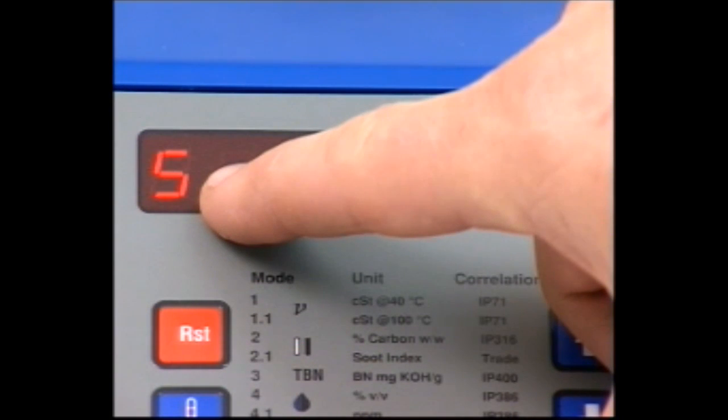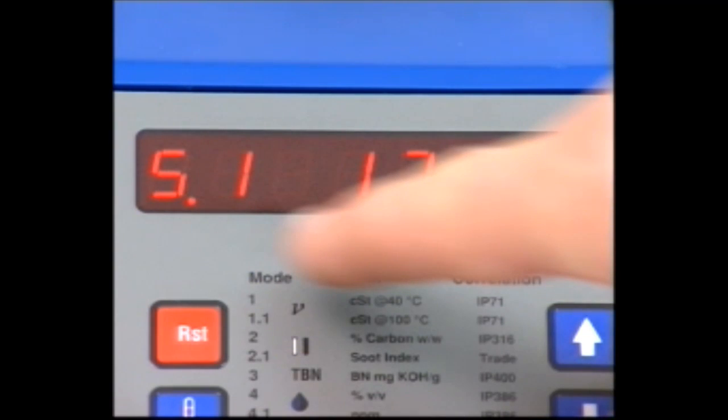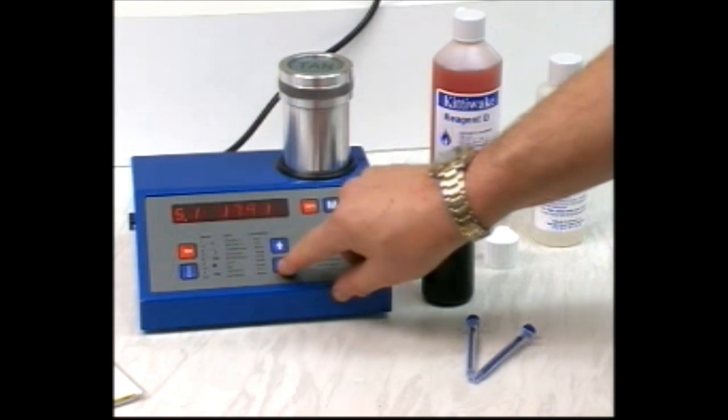However, if your sample is synthetic oil, use mode 5.1. See your user manual for a fuller explanation of this.